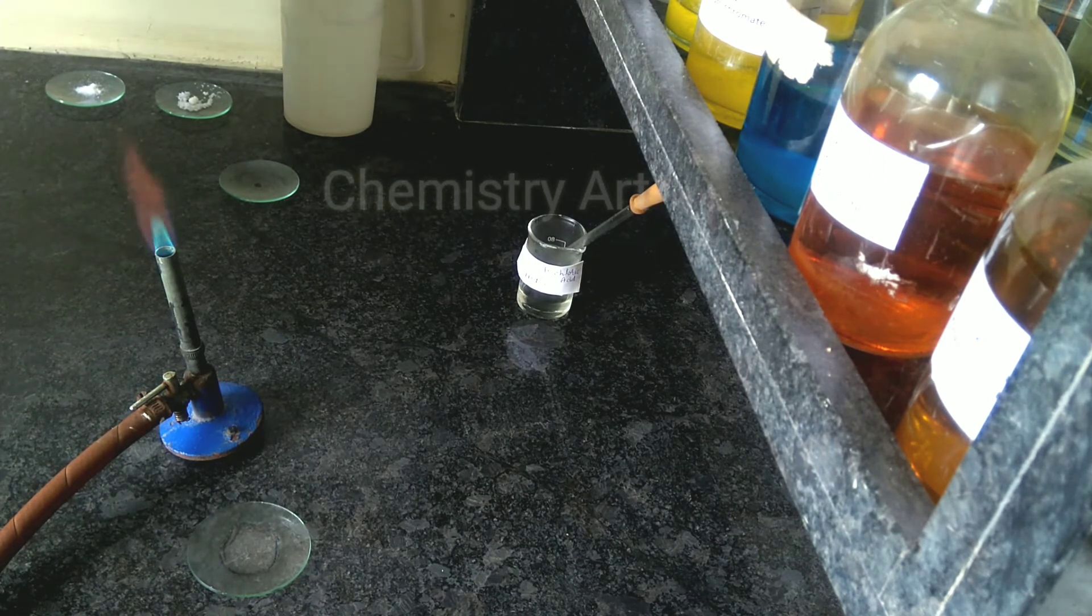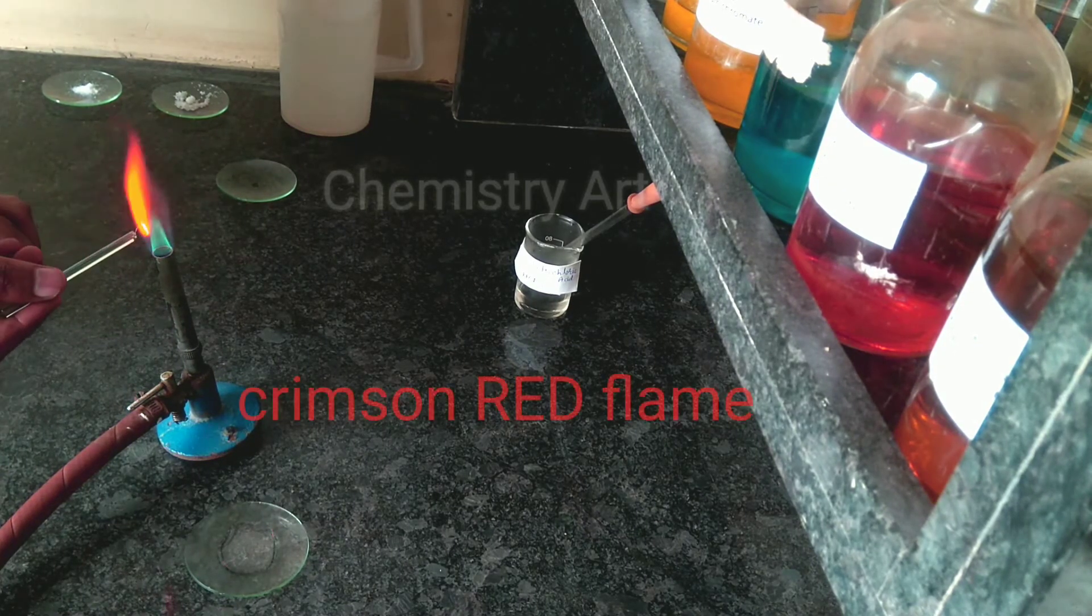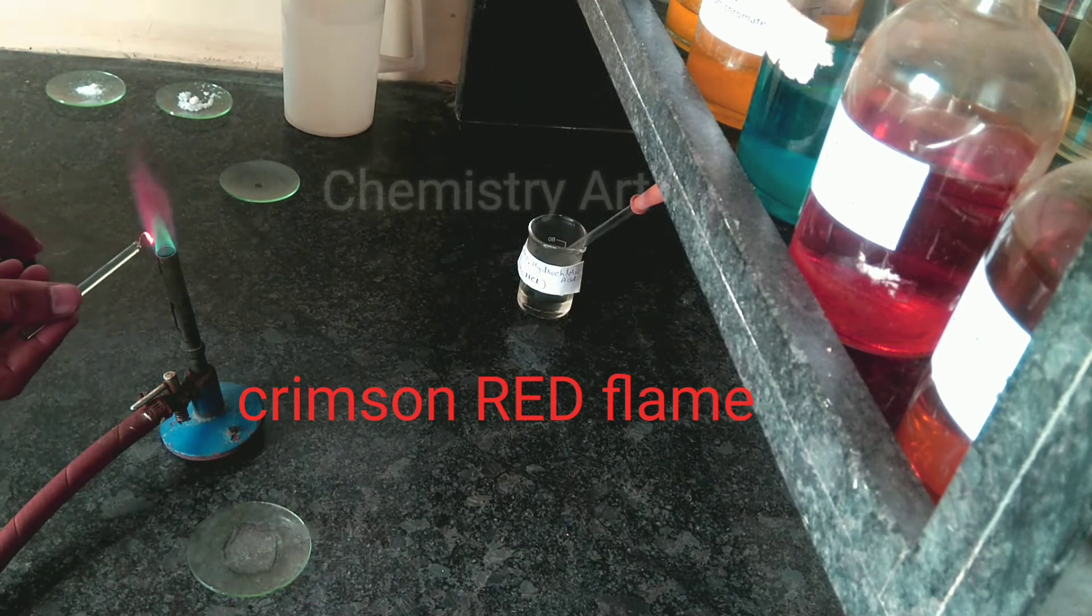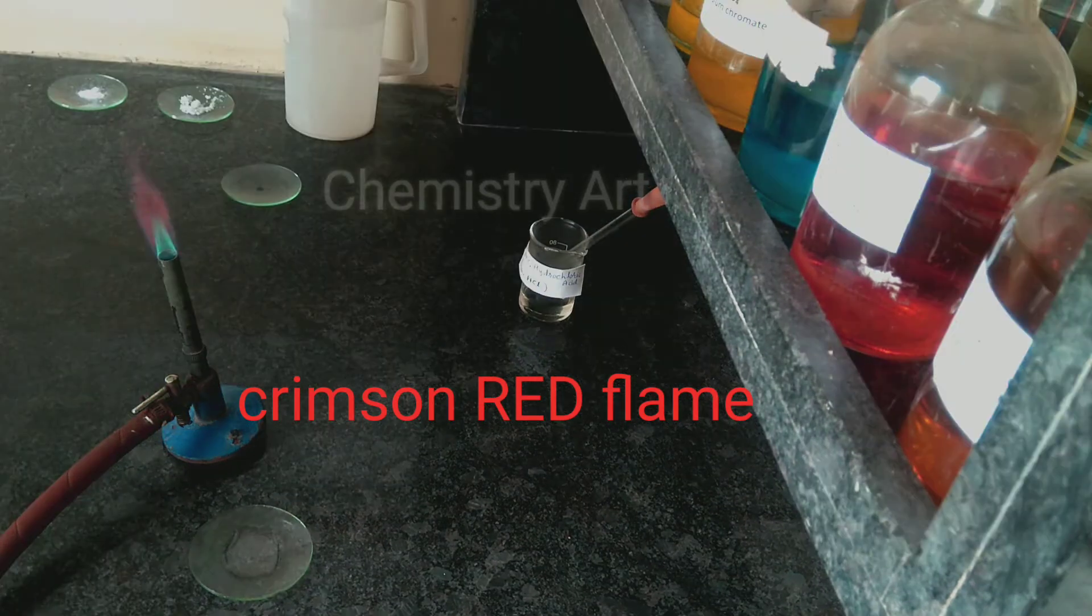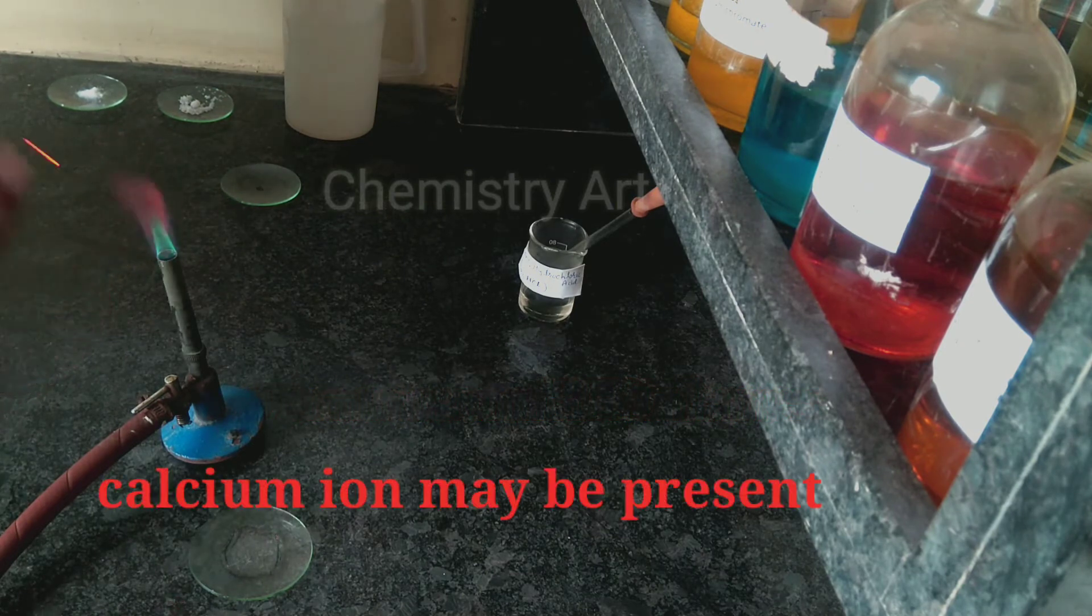Let me show you again. You can also use cobalt glass. Here it's a brick red color. From cobalt glass you can reduce the extra yellow flame. We are generally not considering the yellow flame.